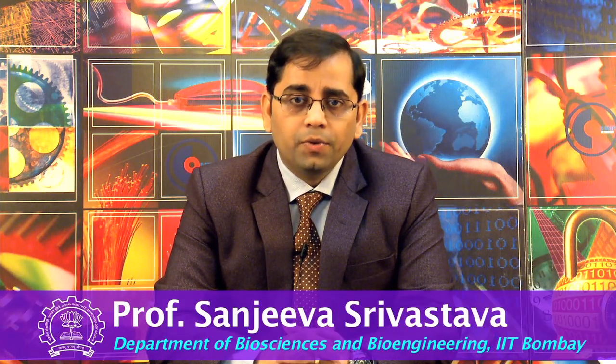So this now completes the two lectures on bio-layer interferometry for studying biomolecular interactions, where we discussed this with application scientist Mr. Sushil Vaidya from Pall Life Sciences, and he gave you some basic understanding as well as a hands-on demonstration session of this novel technology platform. We'll continue discussion about new technology platforms for biomolecular interactions. In the next lecture, we'll continue with another technology platform for biomolecular interaction analytics using microscale thermophoresis or MST technology along with Tycho NT technology. So these new technology platforms will be discussed in the next lecture. Thank you.